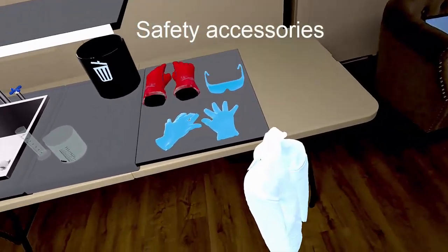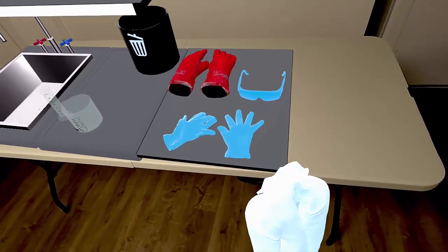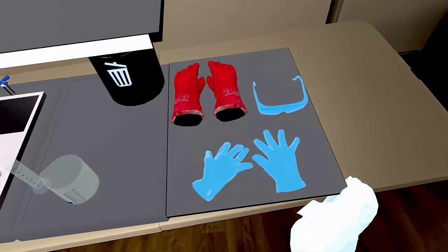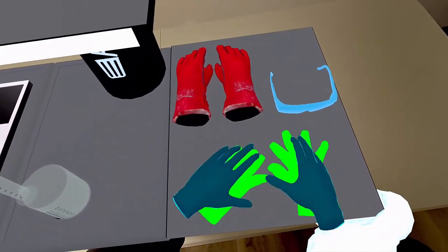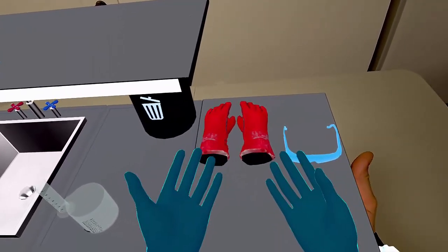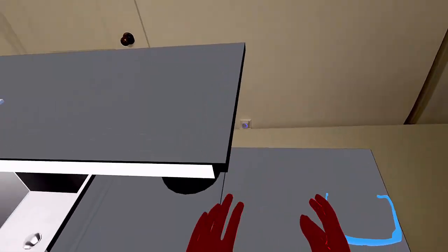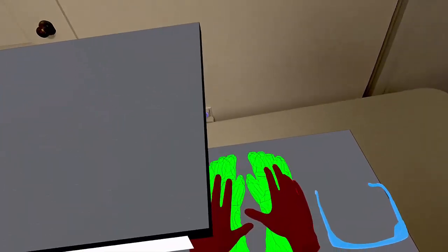Safety accessories such as gloves, safety glasses, and the lab coat are located on the virtual table on the right and can be used during a lab. To grab them, just place your hands on the desired accessory and click once on the button at the base of the right controller with your middle finger. When the accessory is picked up, it will disappear from the table and you will see it appear on yourself.